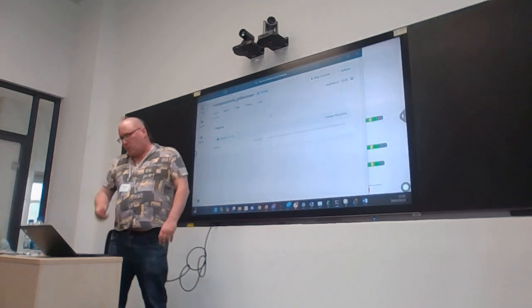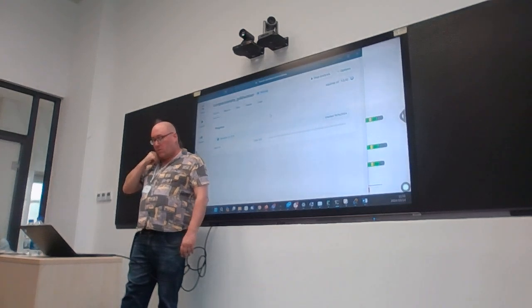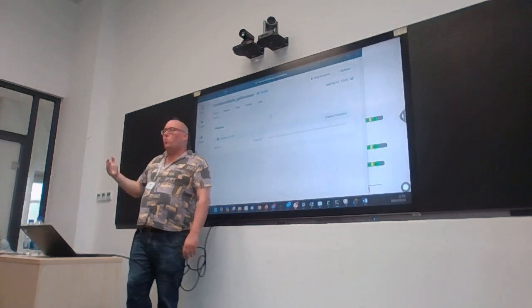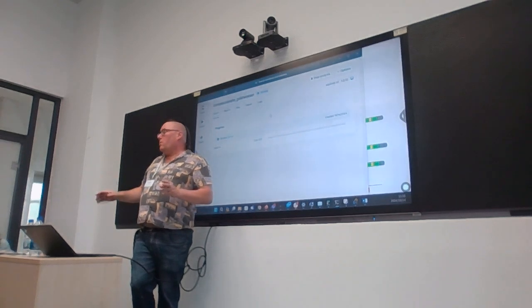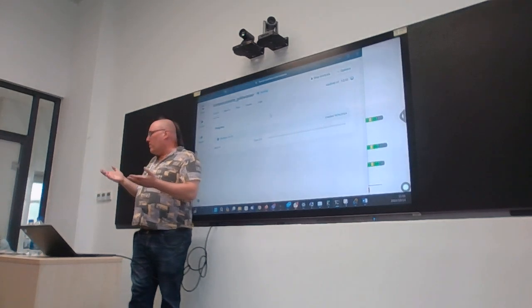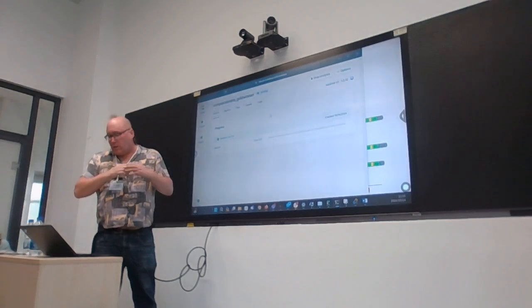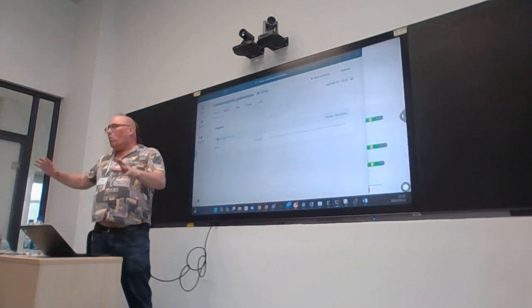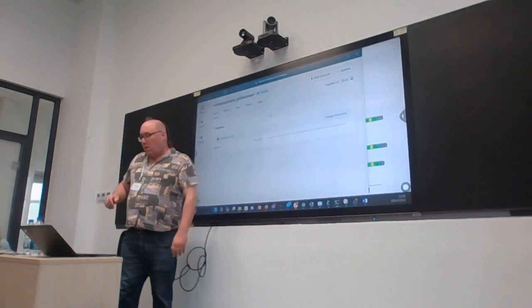Yeah, that's why it's taking a little bit long. And my computer is not making life easier. So you can run Squirrel without... I'm running Squirrel with all of the options. You can run it just to do the quality control and provide the masked final sequences. But I just want to show what you get when you run it with all of the options, because the output is quite nice to look at.